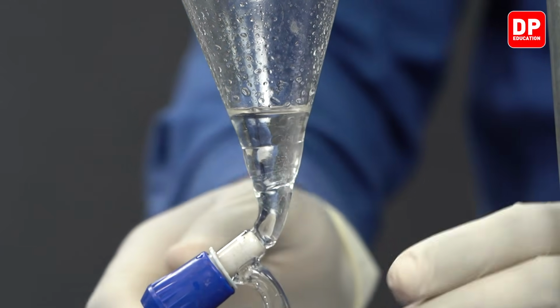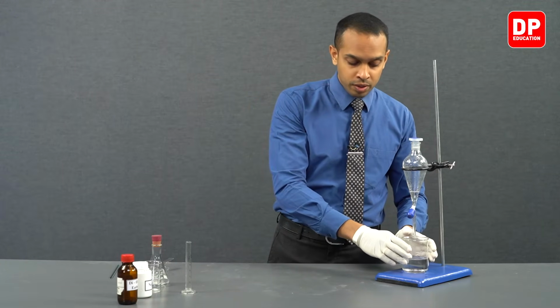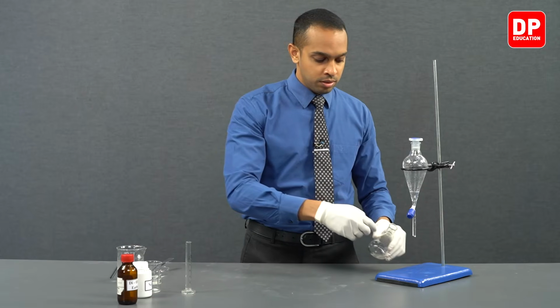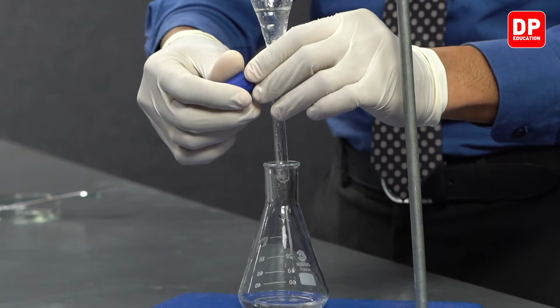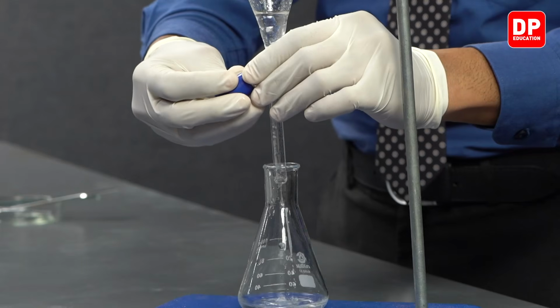Now we have very carefully separated out only the aqueous layer into this beaker, and we can take our Erlenmeyer flask and continue to separate out our diethyl ether layer into our Erlenmeyer flask.